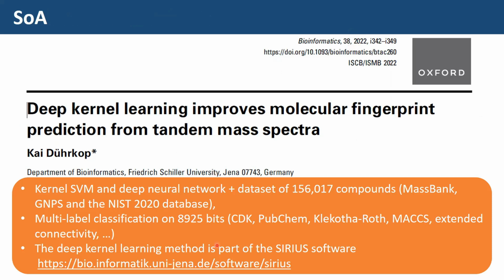But yes, they use a different type of modeling approach, because they use kernel SVM and deep neural network.